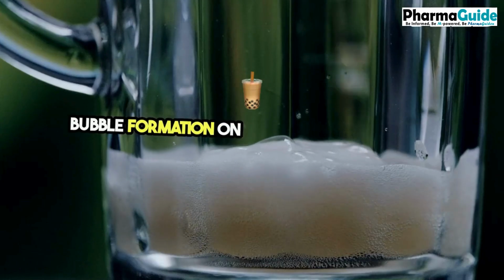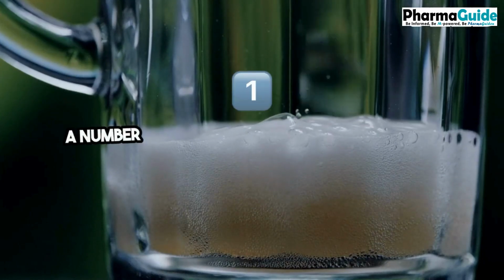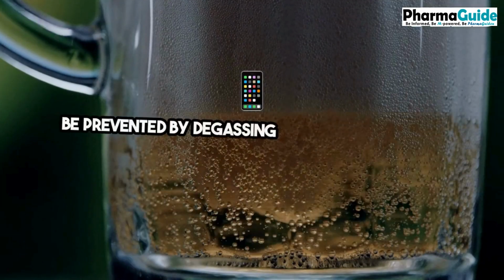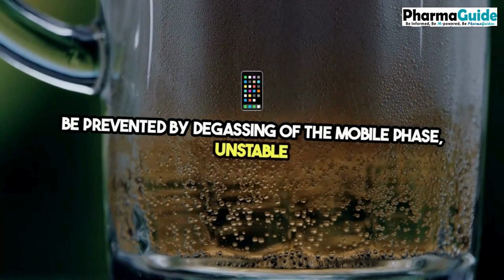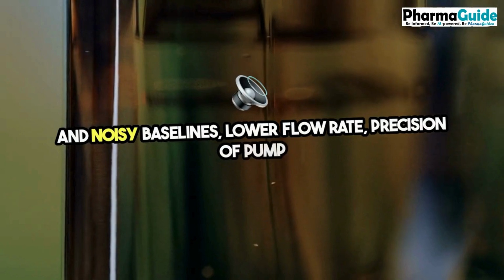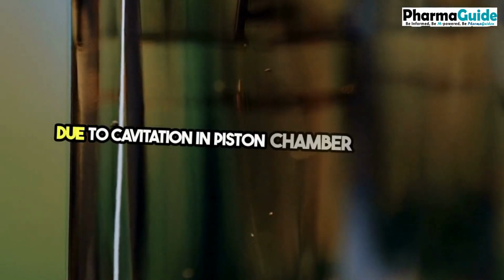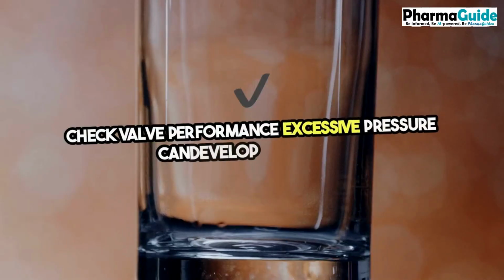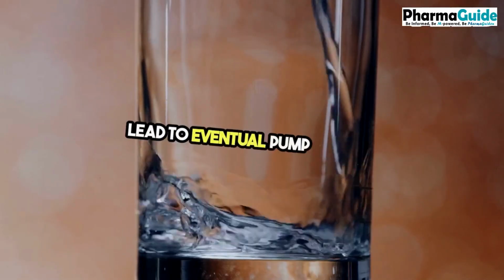Bubble formation on mixing of solvents can lead to a number of problems in HPLC analysis, which can be prevented by degassing of the mobile phase. Unstable and noisy baselines. Lower flow rate precision of pump due to cavitation in piston chamber or effect on check valve performance. Excessive pressure can develop, which can lead to eventual pump failure.